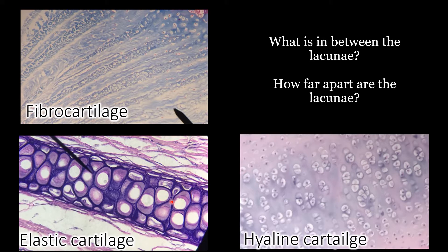If you look at elastic cartilage, you're going to see little fibers in between the lacunae, and the fibers you're seeing are elastic fibers. When you look at fibrocartilage, you also see a fibrous stringiness, which you'll see better in closer pictures. But if you look at the lacunae, they're much farther apart than what you see in elastic cartilage.